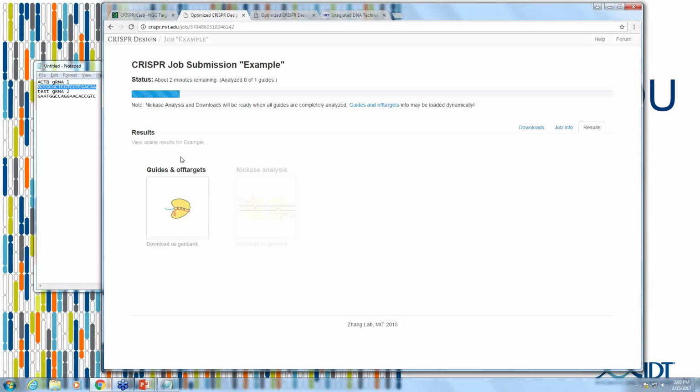And so when doing my own designs, I tend to more heavily weight the off-target risk, but that's really a personal experimental decision. I don't want to tell anyone how to do that too much, but I wouldn't always rule out an experiment or a guide RNA because the on-target efficiency appears to be low. It might still prove to be an effective site.